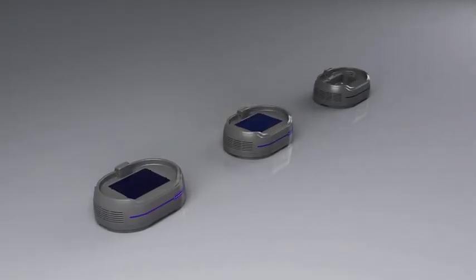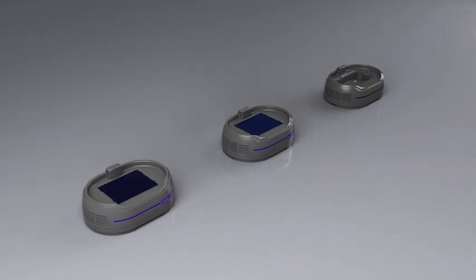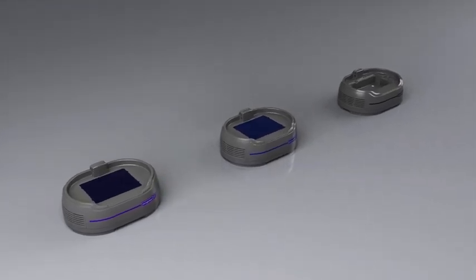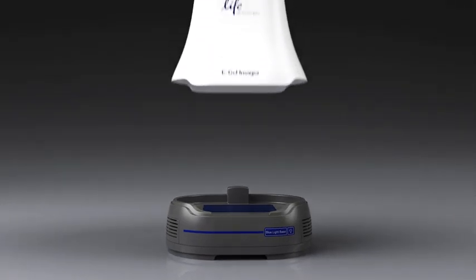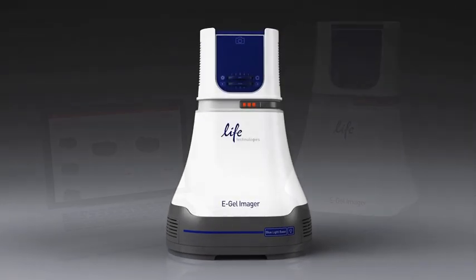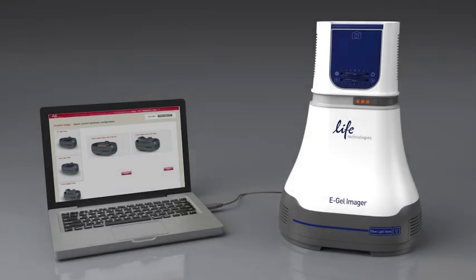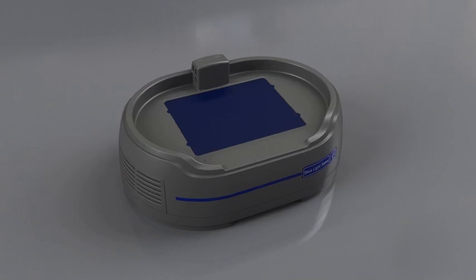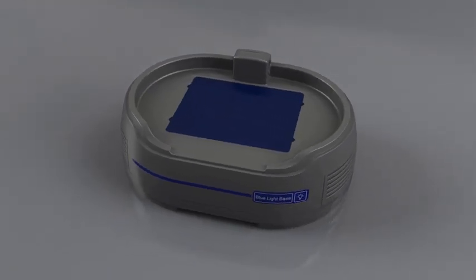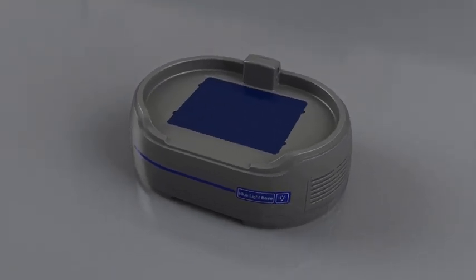There are three components to the eGel Imager system: a set of interchangeable bases, a camera hood, and a software package. Each component alone has individual strengths, and combined they offer exceptional flexibility and power to capture and analyze images of your agarose gels.